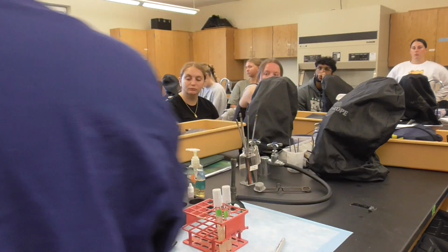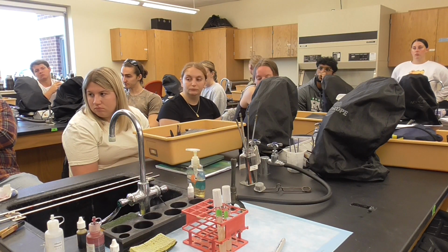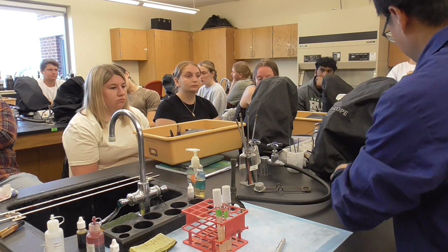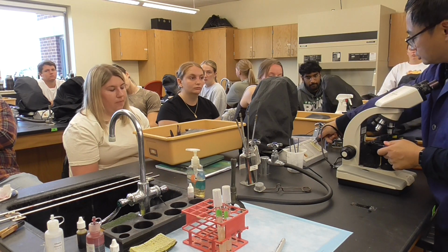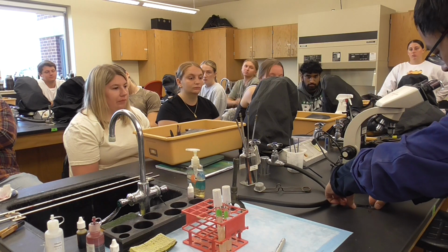Okay. See whether this one is good or not, whether it's E. coli or it's a contaminated bacteria. Sometimes it happens it's not E. coli. So let's see. We're going to be using this microscope again, and also this is a time to practice using the microscope.